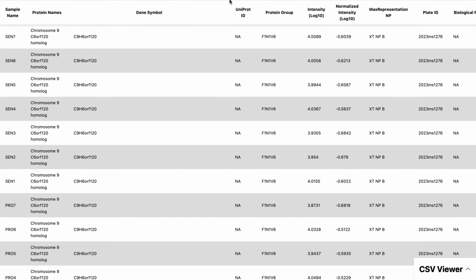Both of these files are from published data, and they can be uploaded. In this demo, they will be uploaded. You can also use an internal SDK to retrieve this data, but in the demo I'm using published data and will be uploading.